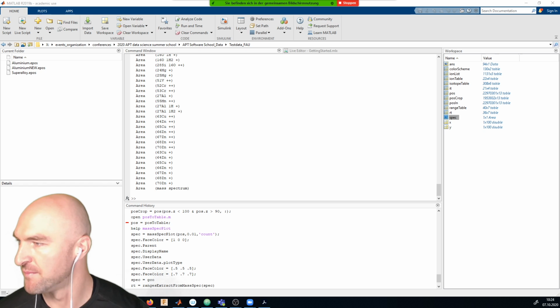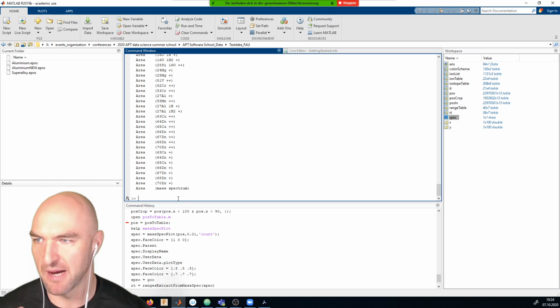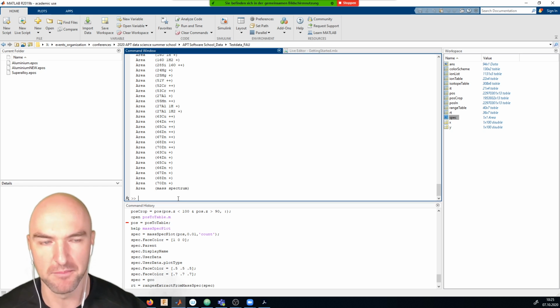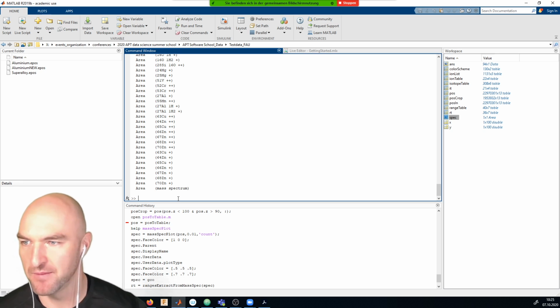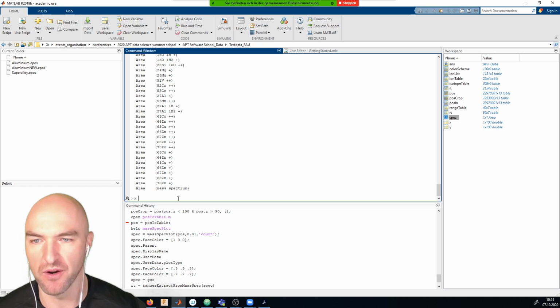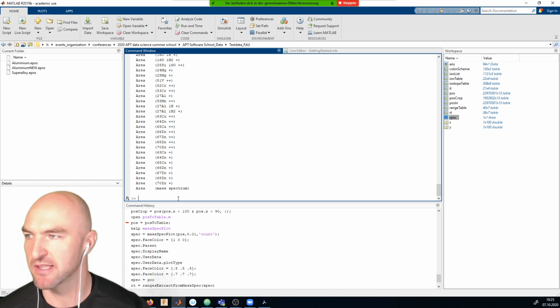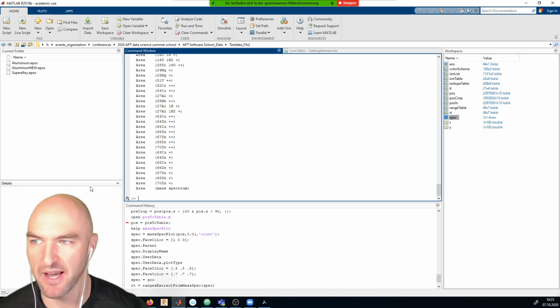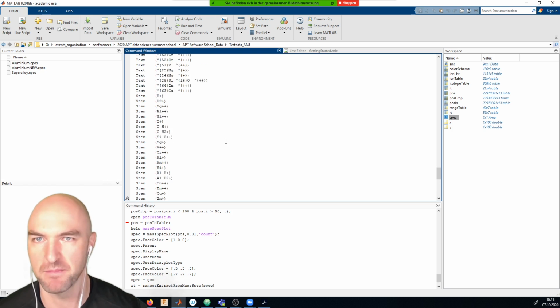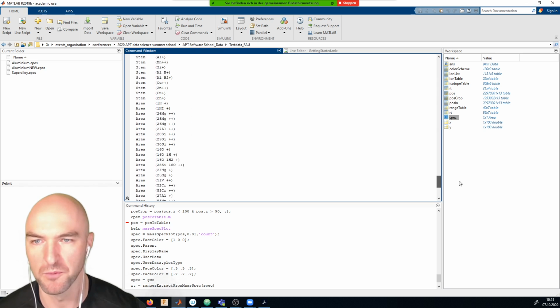And how to then also come up with a basic plot of your Atom Probe data. Just very quickly, we'll go into that in depth later on. And this should set you up for concentration calculations, concentration plots, and so on and so forth. So with that, I want to ask you: are there any questions for the first part of the Atom Probe School?